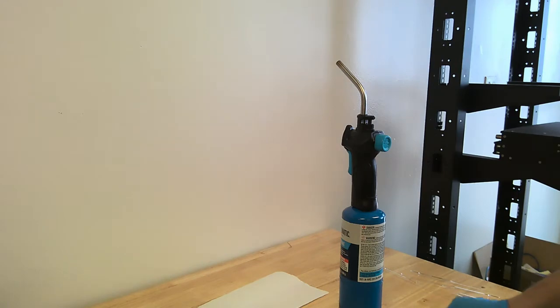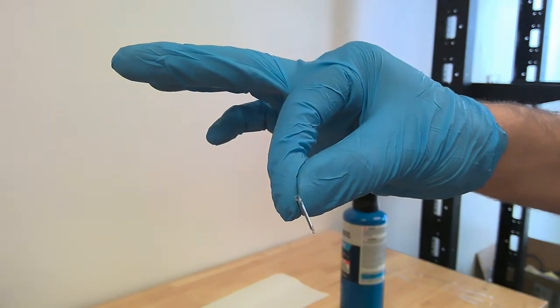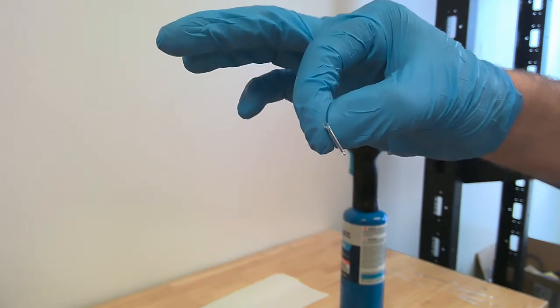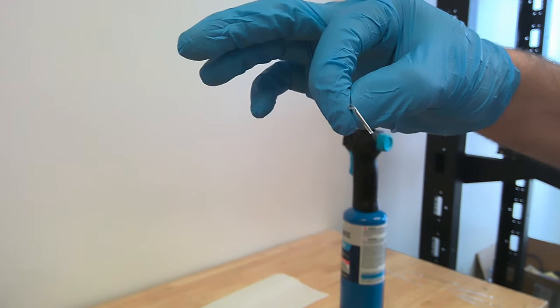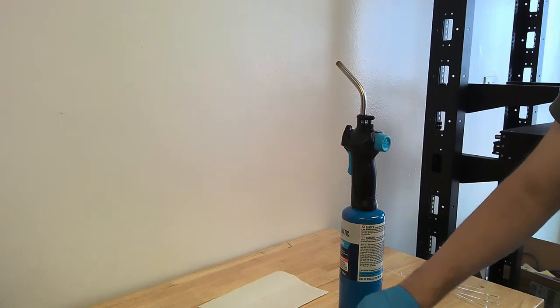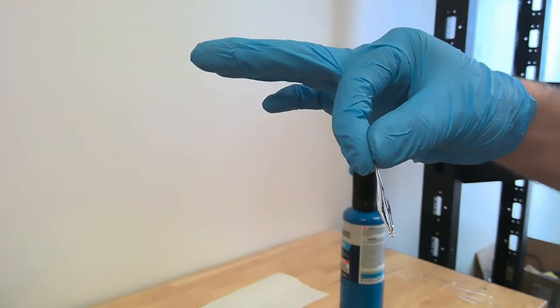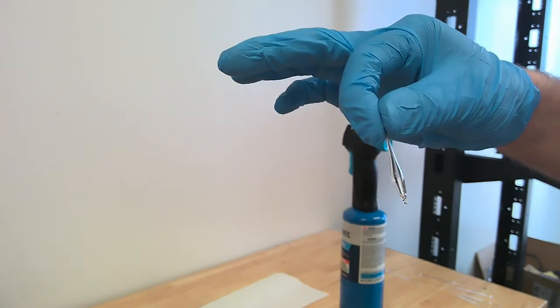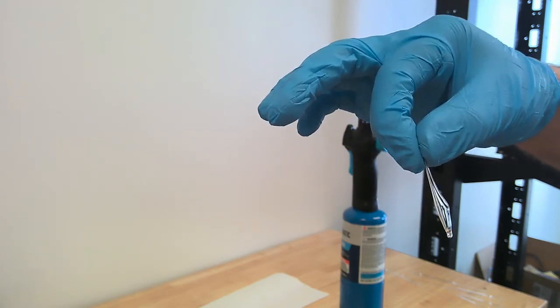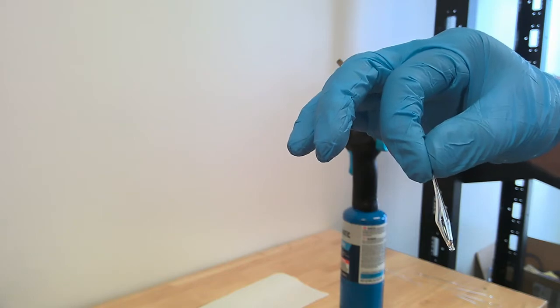Additionally, and this is really cool, you can prepare a stir bar using a paper clip and a 7-inch glass pipette. These are very useful for running chemical reactions rather than having to buy the Teflon stir bars. Finally, and one of the more important pieces of glassware you'll be preparing, is what's known as a micropicnometer. This is a relatively large version of a micropicnometer, and we'll prepare a smaller version today in our live demo. A micropicnometer is used to measure small microscale volumes of liquids, and it's used to measure the density of organic liquids of a discrete volume.